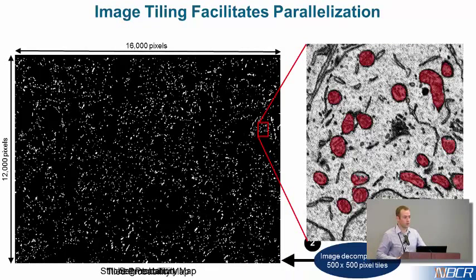You'll see a lot more errors here because mitochondria are much more irregular, so you'll get a lot more artifacts. However, like you see, the transition between these two steps, a lot of those drop out by applying the same thing, like I just said, applying morphological filters, applying things that get rid of 3D segmented objects. Again, you see there, for example, here is what I believe is a capillary endothelial cell. That's obviously way too large to possibly be a mitochondrion, so that drops out in our post-processing filter.